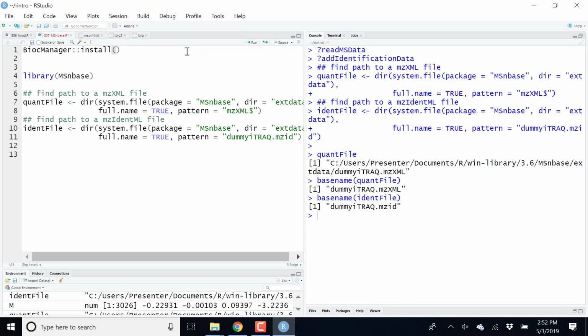And it's not install.packages. install.packages is going to look for packages on CRAN, but here we have packages on Bioconductor, so we need to use a slightly different function. That uses install.packages under the hood, but this function knows that it needs to look for these packages first in Bioconductor. So we need to say BiocManager::install("MSnbase"), and that function, exactly as install.packages did yesterday, is going to look for this package MSnbase in Bioconductor, and it's going to install that one plus all the other packages, all the dependencies.